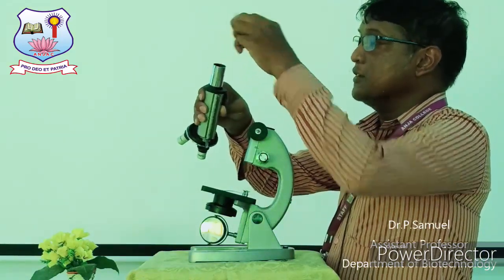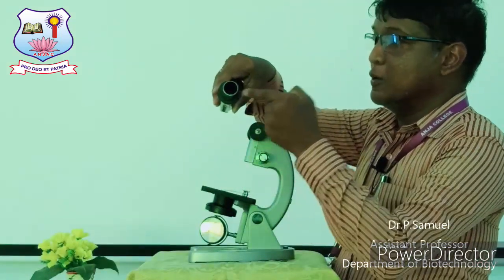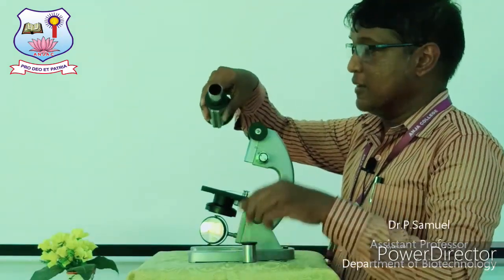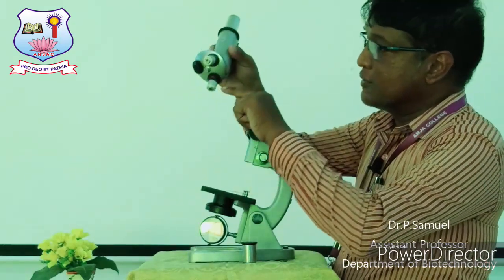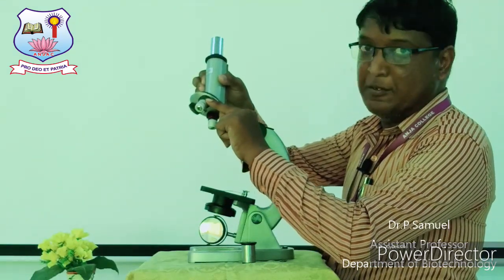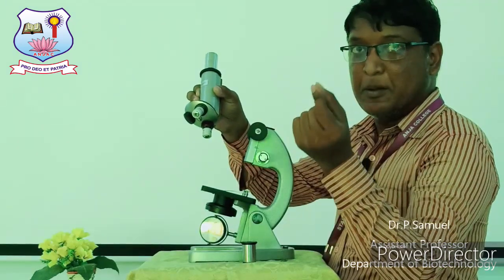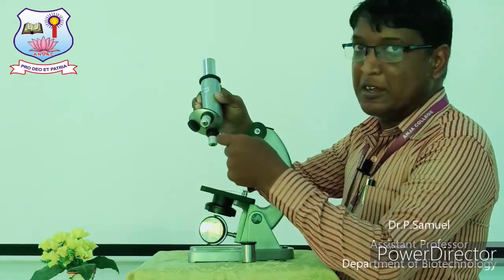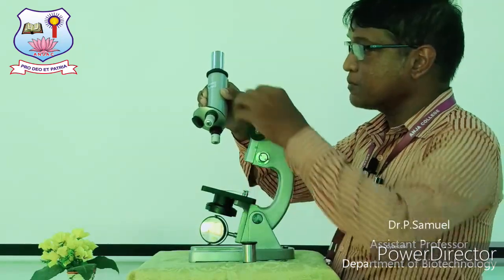Once you take the hollow tube in your hand, this is called the canal, the hollow canal, through which the light enters into the eyepiece. And as I told you before, this one is the low power lens and this one is your high power lens, and these should be frequently cleaned with filter paper or tissue paper to remove the dirt particles, which will help you to visualize the image clearly.